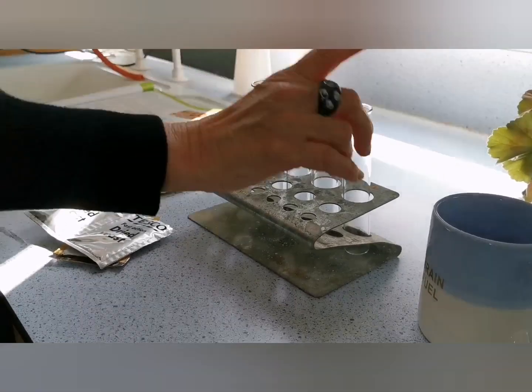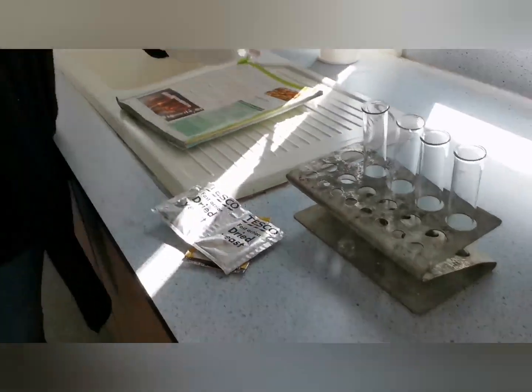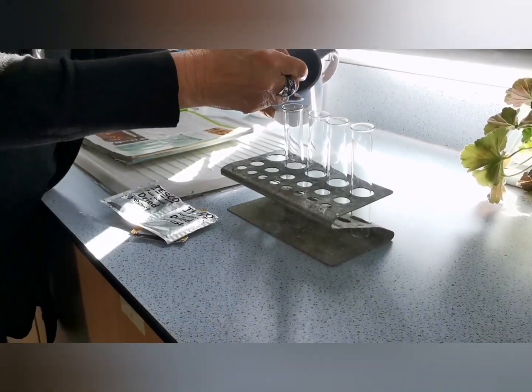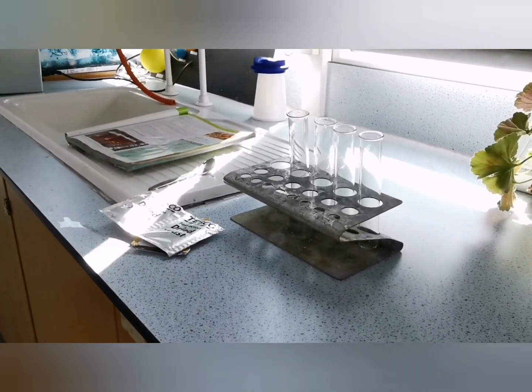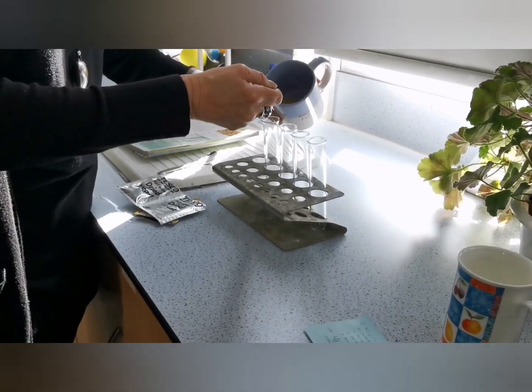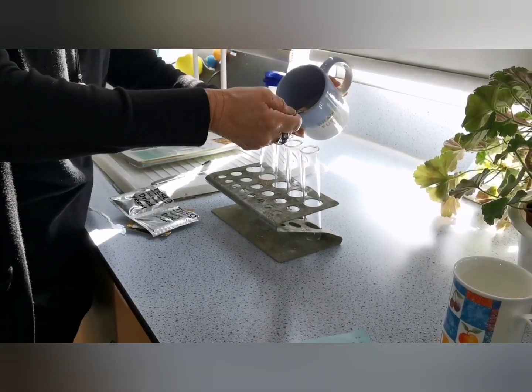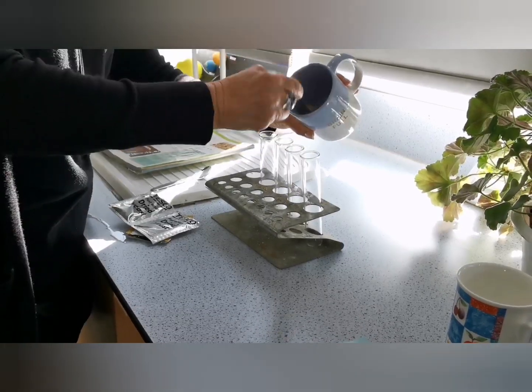So what we're going to do first of all is we've got some yeast here. So this is straight from our packets. So if you were making bread at home, you would use yeast to actually do this. So we're going to put a teaspoon. Actually, I'm going to use the big spatula, might be easier. So we've got a spatula here, and we are going to try and keep our controls the same for each one. We're going to put 2 of these in each boiling tube. A little bit of spillage here, but that's okay.